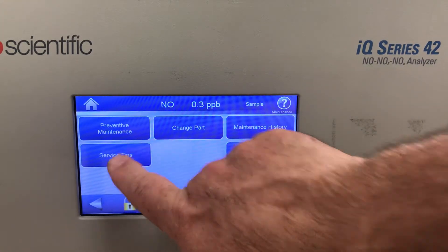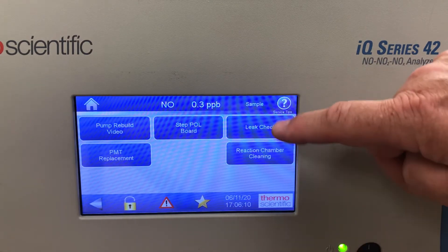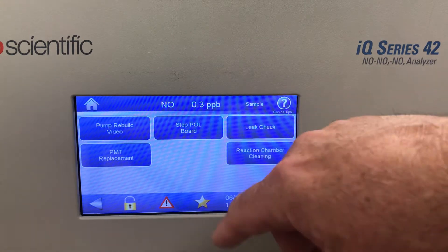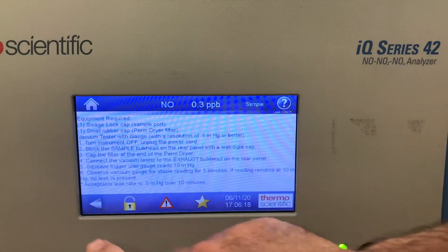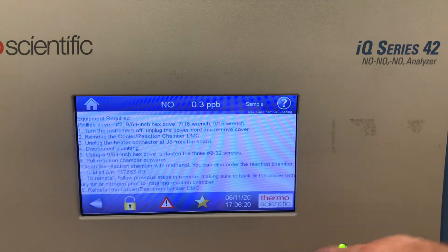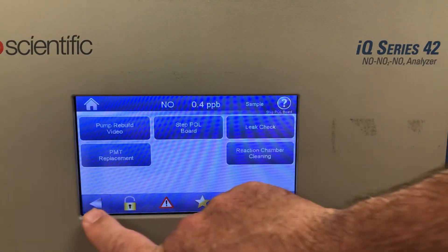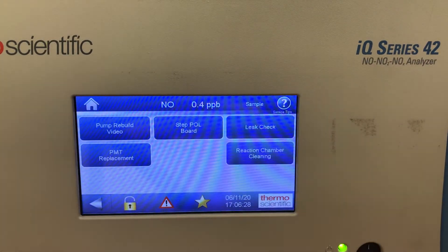There are also service tips. In here there are step-by-step instructions on how to do a leak check, reaction chamber cleaning, and PMT replacement. I can touch any of these and there are detailed instructions on how to do each procedure, all the way through PMT replacement, giving you a step-by-step guide.